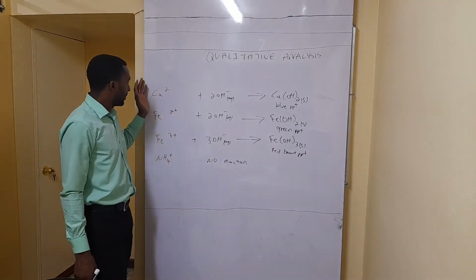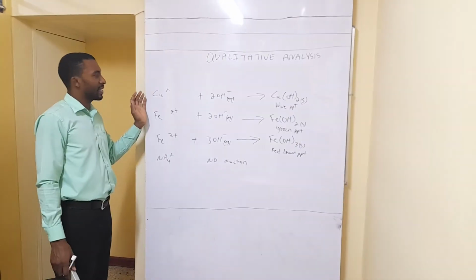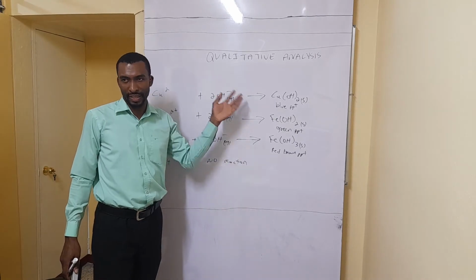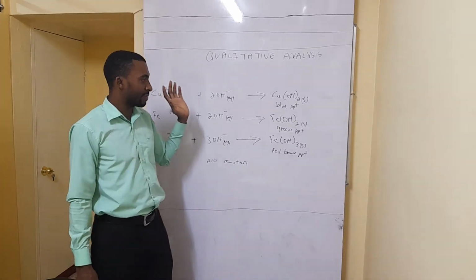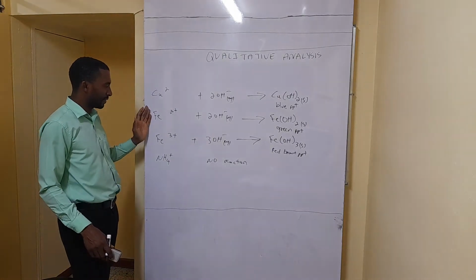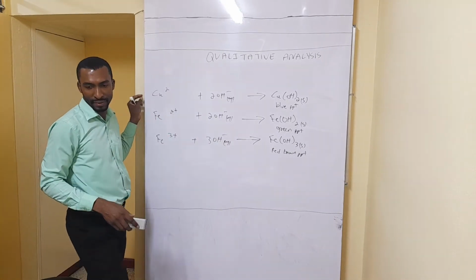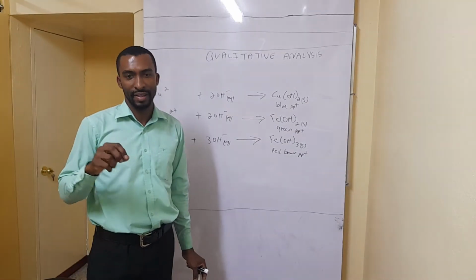With these additional cations, you can see that based on the color formed, blue, green, red-brown, we would not really need to do the test with ammonium hydroxide to distinguish between them. However, the exam still requires you to know the test with ammonium hydroxide for copper, iron 2 and iron 3. So let me tell you what will be formed and whether the precipitate is soluble, yes or no. Then we're going to move on to identifying gases and then identifying the anions last.